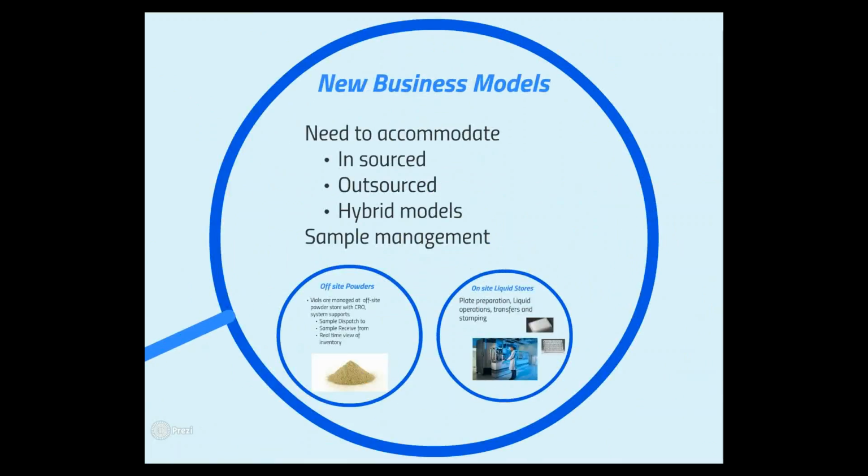Second area, these new business models. So we need software that can accommodate compound management and sample management processes that are run in-house, or they might be outsourced to contract research organizations, or indeed they might be hybrid models where we're running some things in-house and other things out with the CROs.